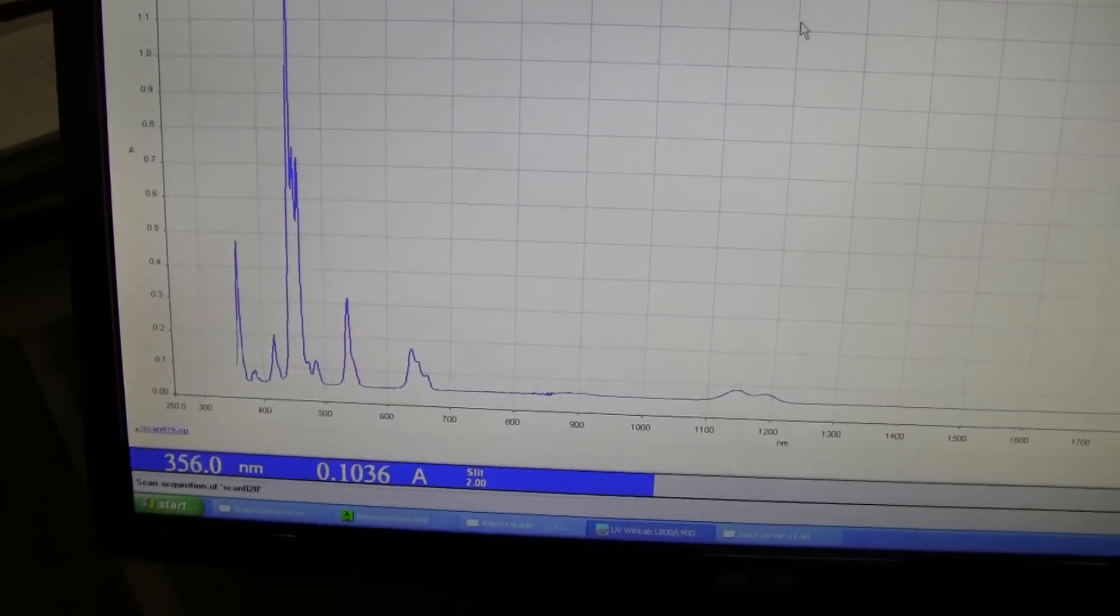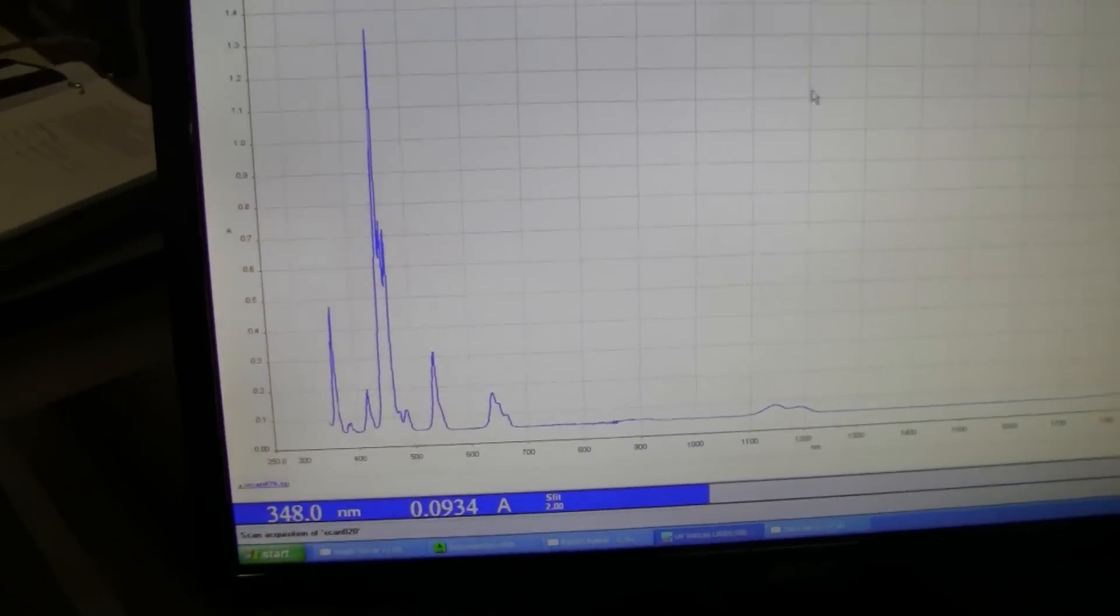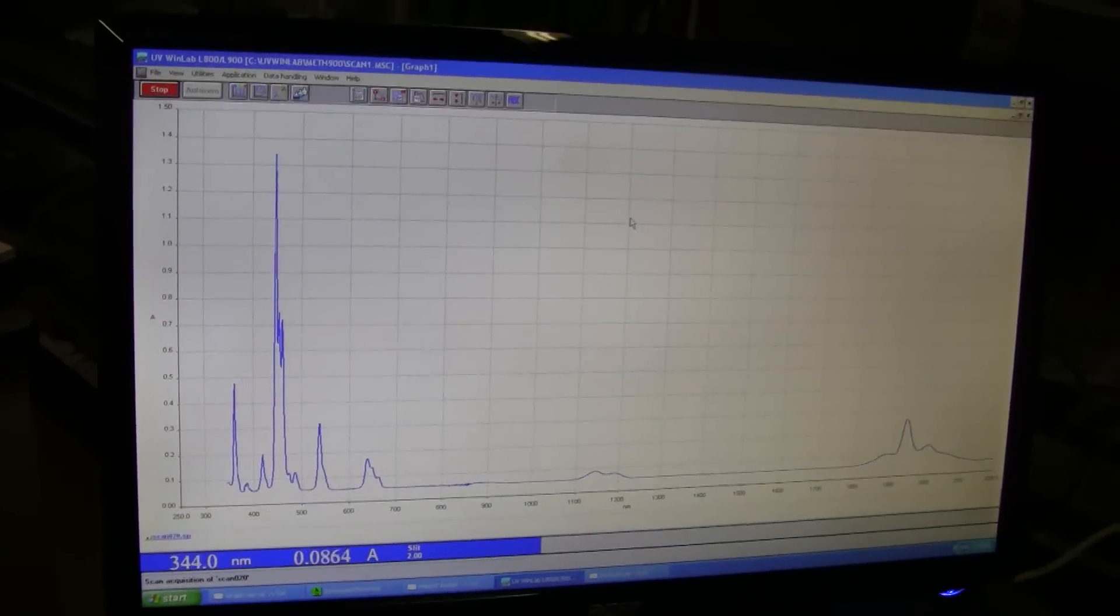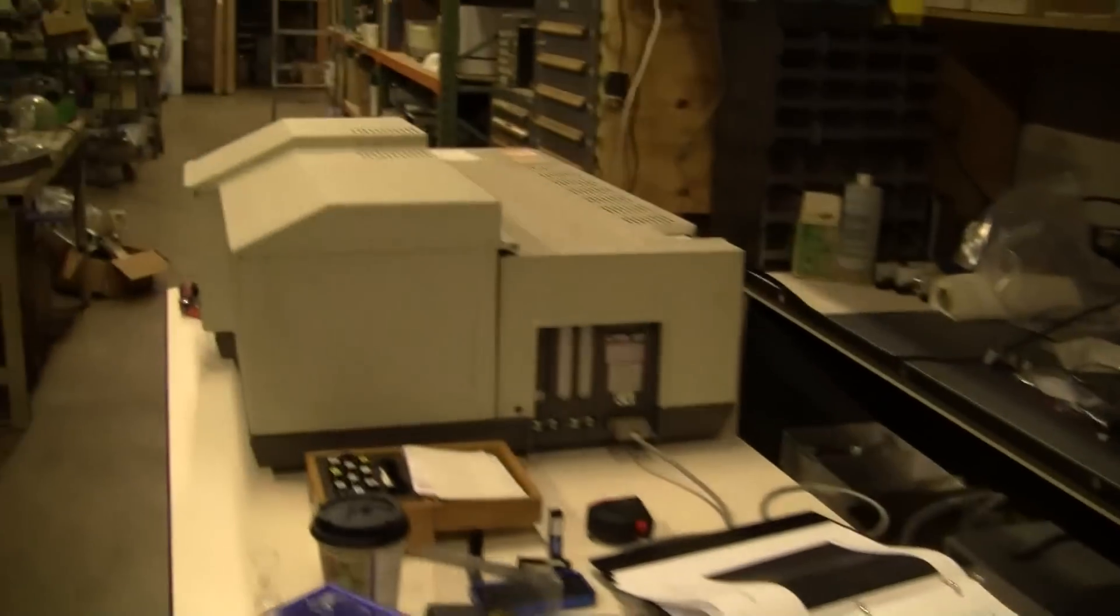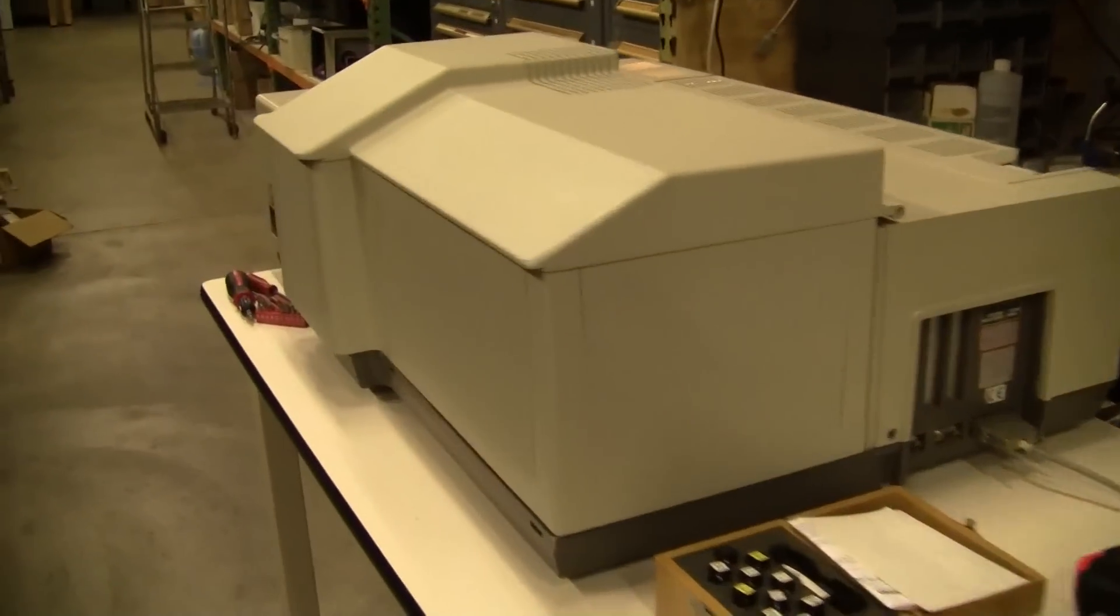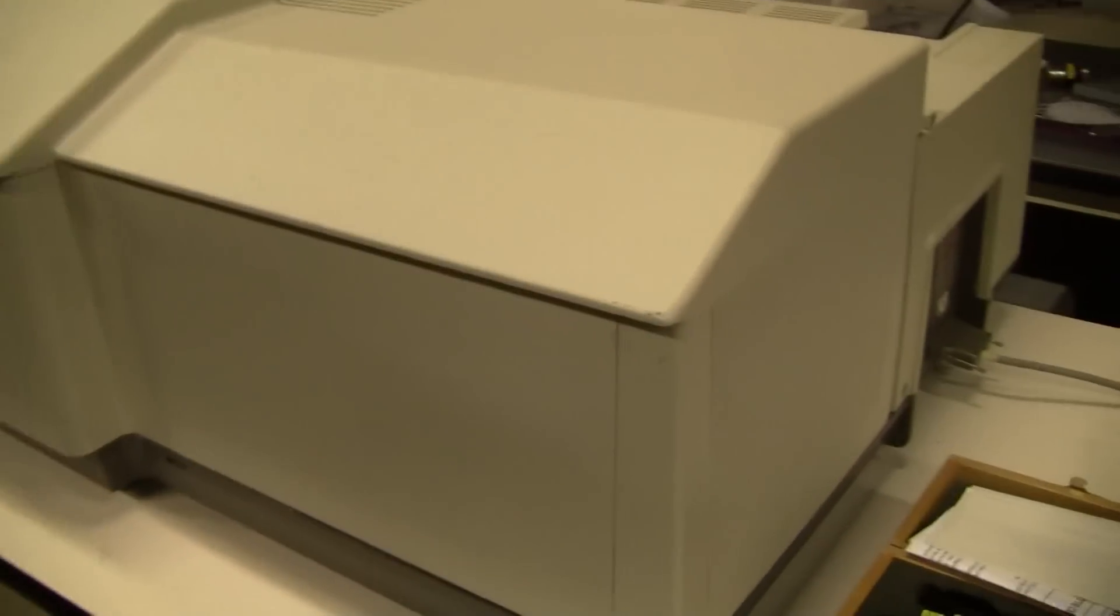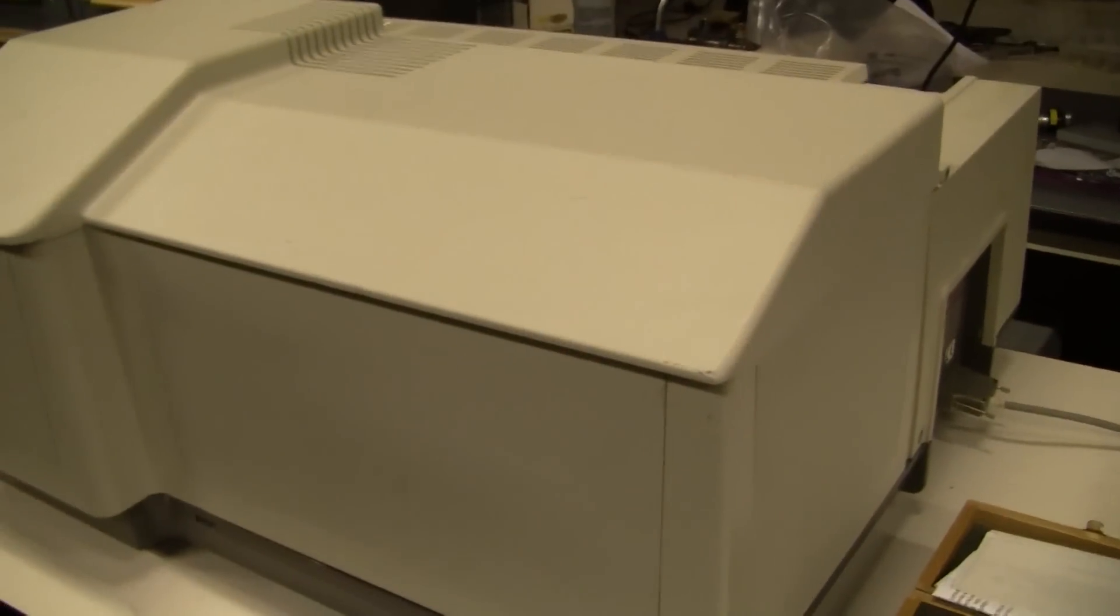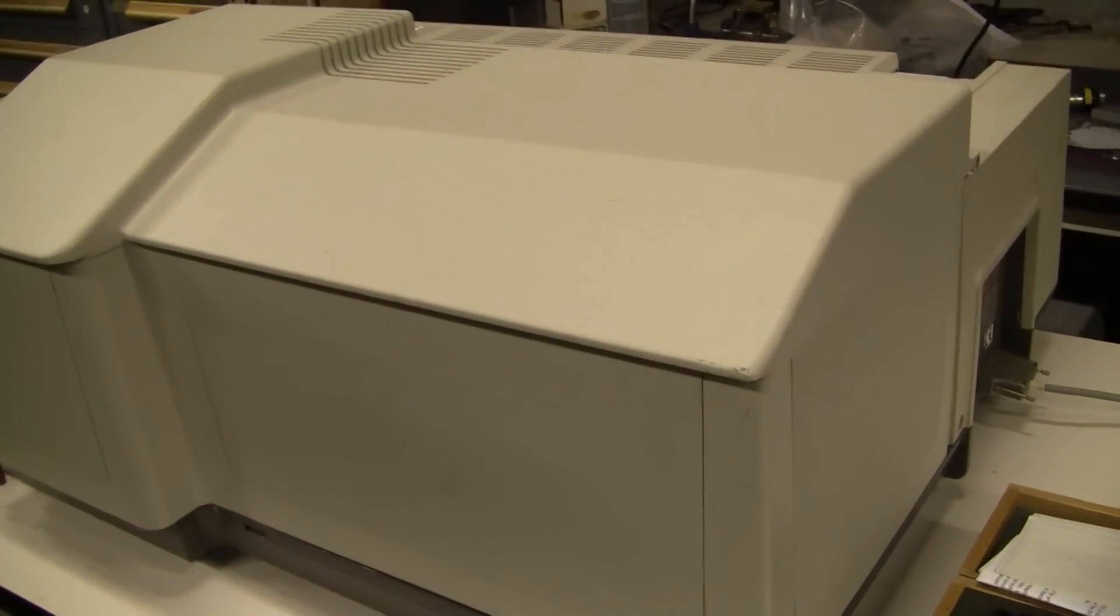When it completes its run, we'll show you the peak values. Then also, I want to open up the optical bench to show you the configuration.